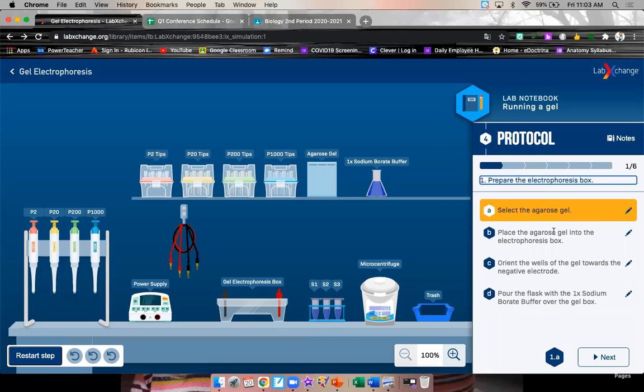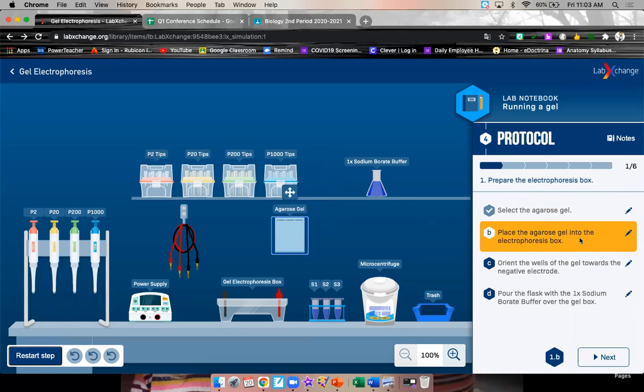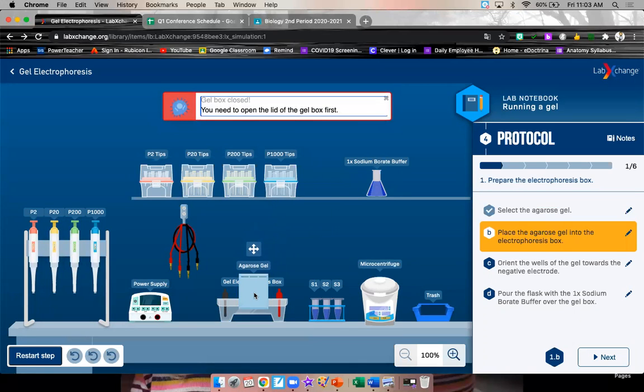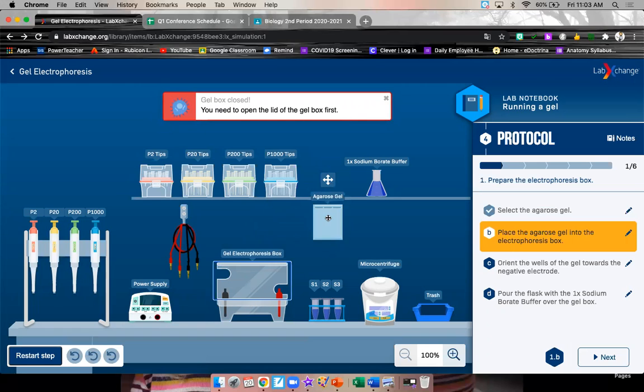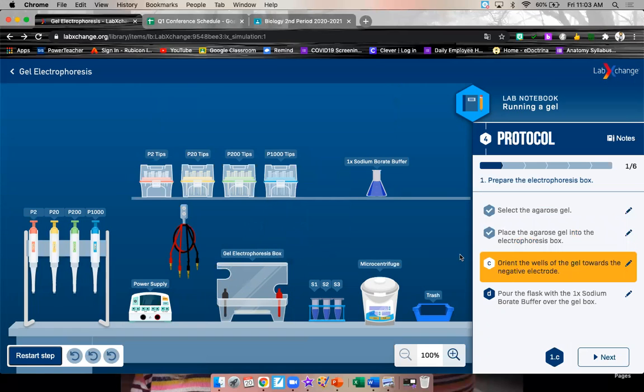Your directions are on the side. At this point, if you are comfortable just reading through the directions on your own, then you can turn off this video and just follow the directions. If you would like me to walk you through it, stick around. A, select the agros gel. Right here, the agros gel. B, place that agros gel into the electrophoresis box. Just drag it in. Oh, we need to open the lid. C, orient the wells of the gel towards the negative electrodes.